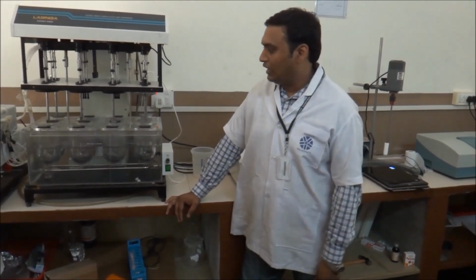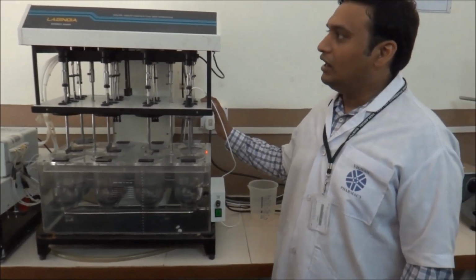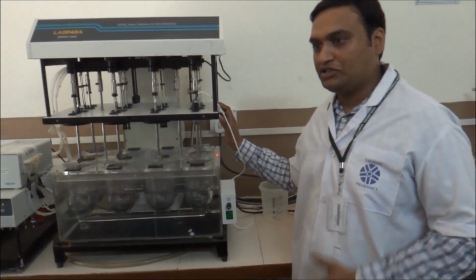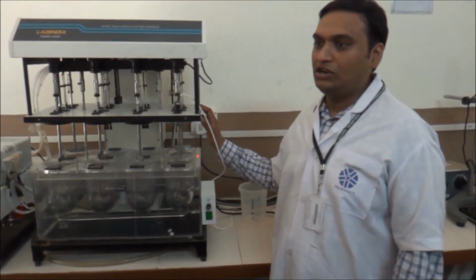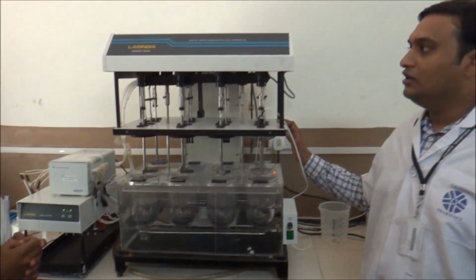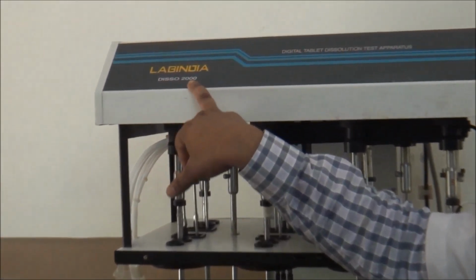So based on that, we have an instrument here which is called the dissolution apparatus, and whenever you are going to learn how to operate an instrument, it is very essential to know the make or manufacturer of the instrument. As you can see, this is a Lab India Disso 2000 model.